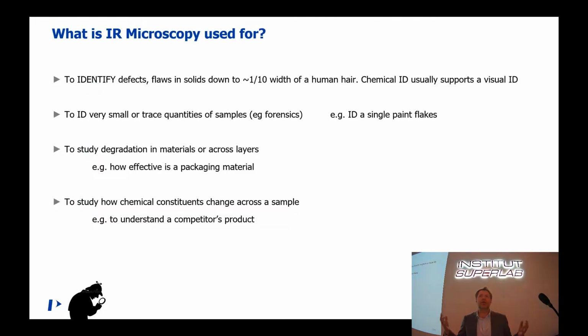So very briefly, I know we've spoken about it in a previous conversation, so I'll go very quickly. But for those that haven't used an FTIR microscope, think about an optical microscope that also has an infrared capability. So you can see the microplastics on the filter, but then you can actually inquire as to what is the nature of those, what sort of polymer they are.